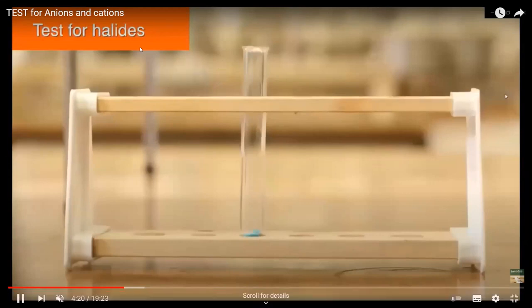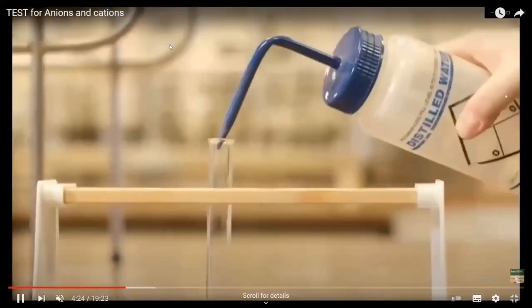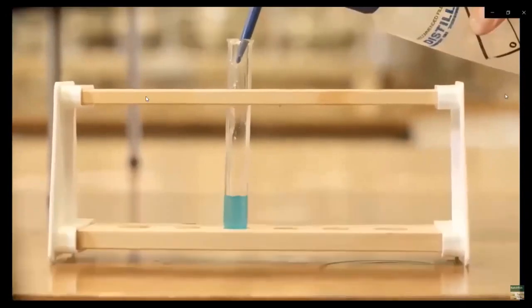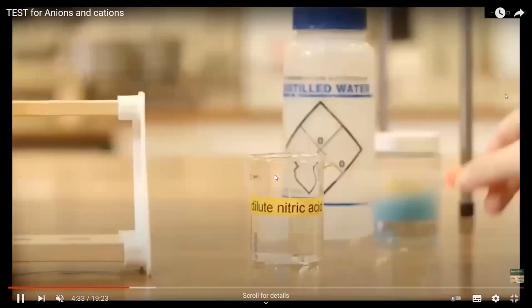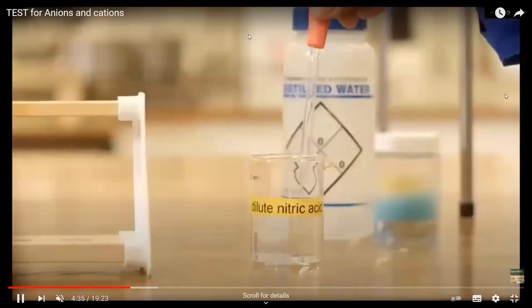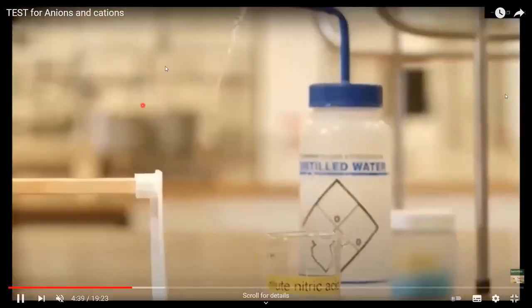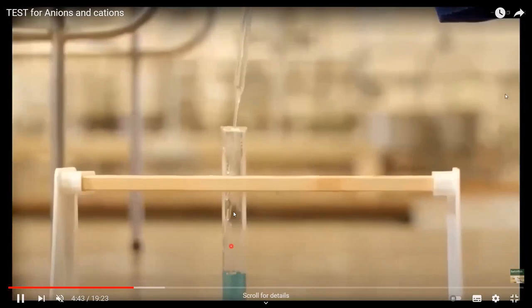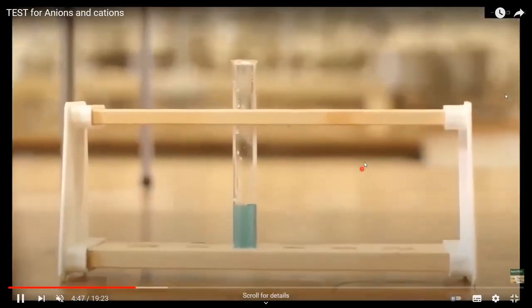So if we want to test a halide ion, first we make a solution. This is distilled water to make a salt solution. We don't know which halide is there. So first we add nitric acid. As you can see, we are adding nitric acid, using a dropper or a teat pipette. And this nitric acid is followed by silver nitrate.